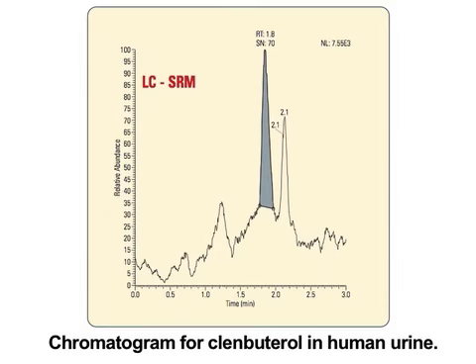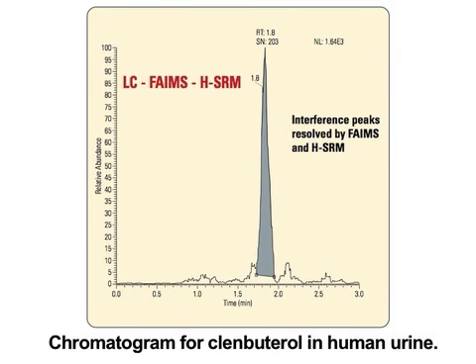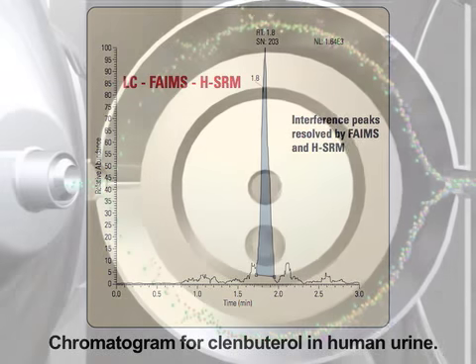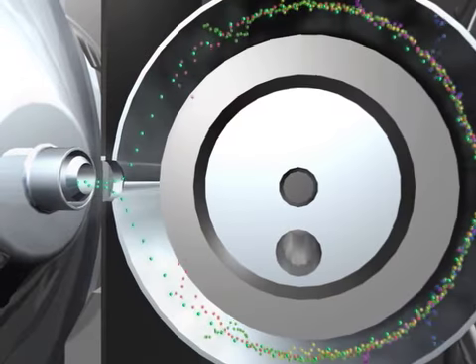As you can see here, this first chromatogram shows a lot of co-eluting interferences and chemical background, in addition to the analyte of interest. When we use FAIMS, we only let the analyte of interest into the mass spec, and so those other interferences have been removed.